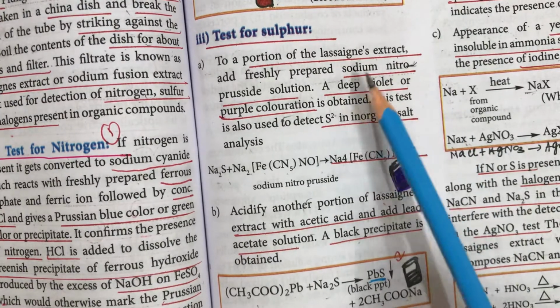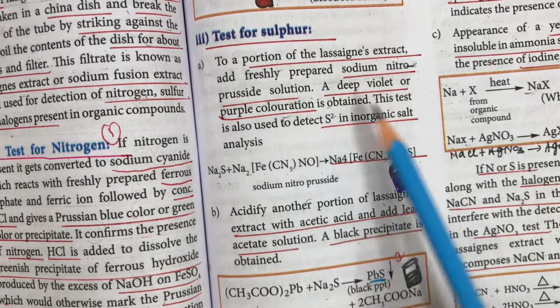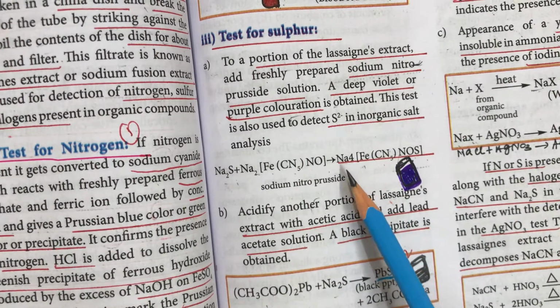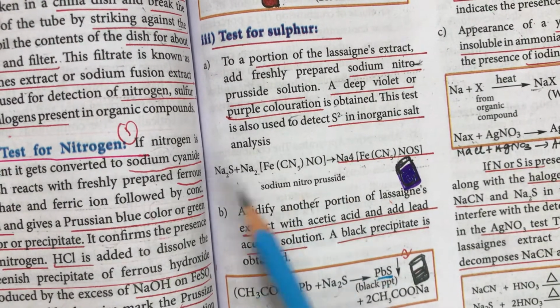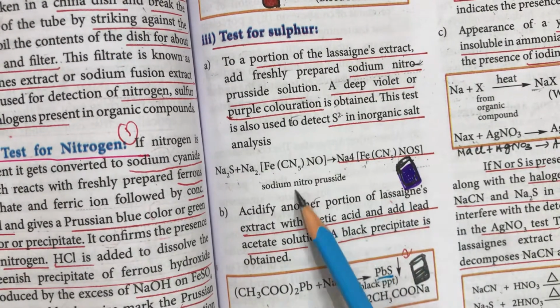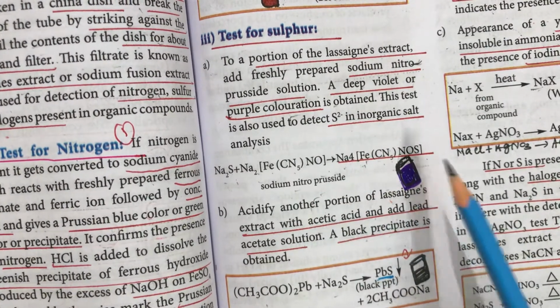You have to take this Lassaigne's sodium fusion extract and add sodium nitroprusside to it. It forms a deep violet purple coloration. So, what is that? The purple violet coloration is Na4[Fe(CN)5NOS]. Sodium nitroprusside, when added with sodium sulphide, forms a complex compound like this. So, only this purple deep violet color shows the presence of sulfur.